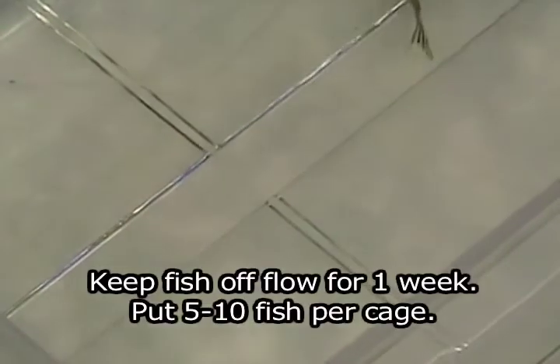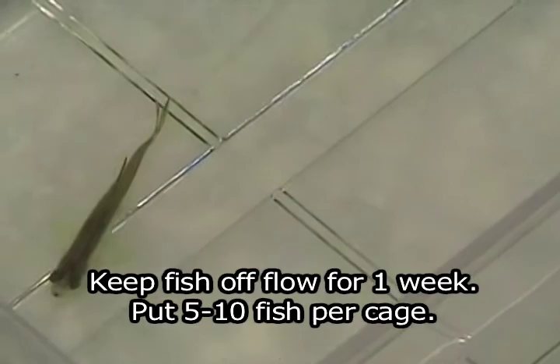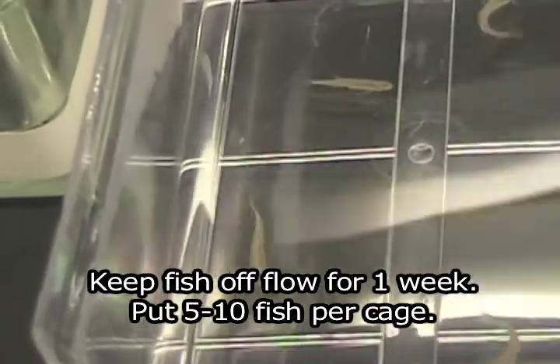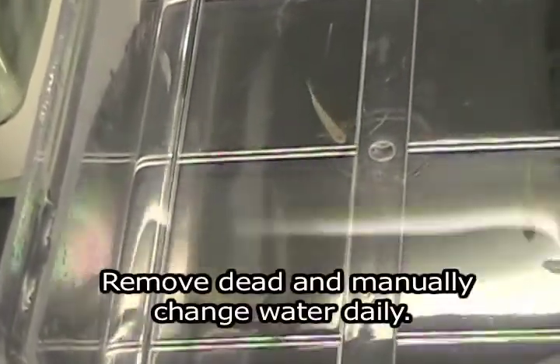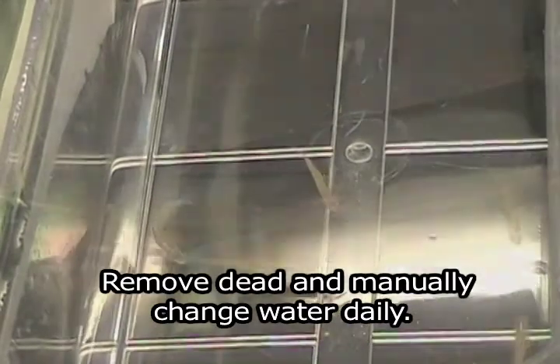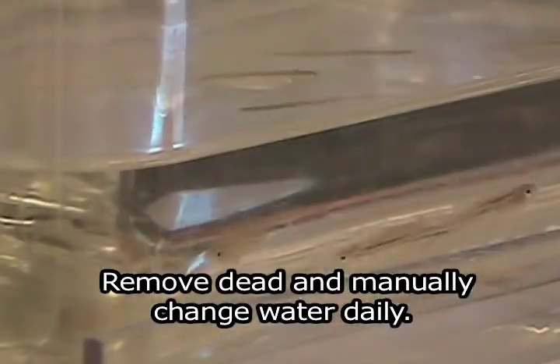Keep fish off flow for one week to avoid infection. Keep about 5 to 10 fish per cage, removing dead each day, and manually change water each day.